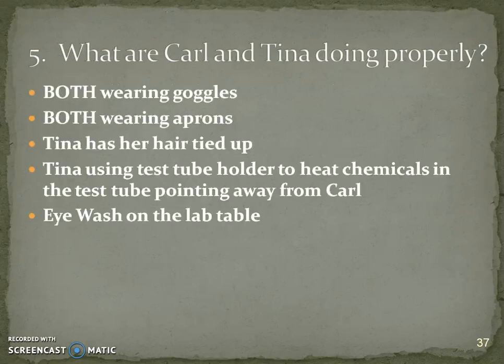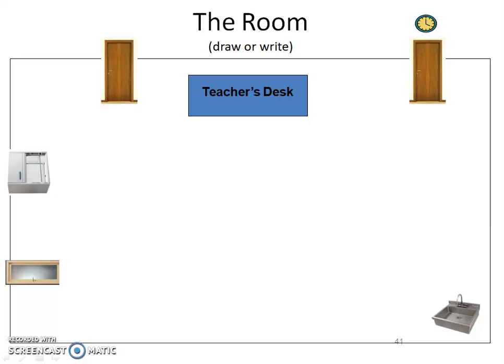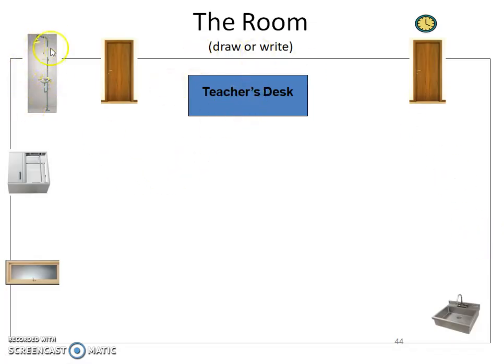Carl and Tina are doing things properly. For the safety shower location: on your packet you have a picture of the room. Here's where you're sitting, here are the desks, and on the left is a door to the back room — right there is your safety shower. Either write it or draw it in. The eyewash station is right under the safety shower, so mark it in the same spot.